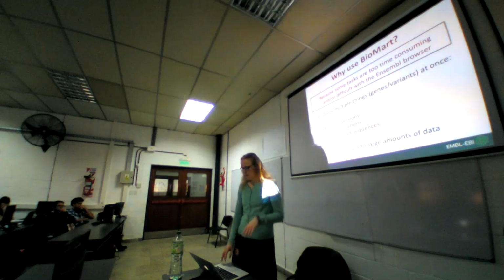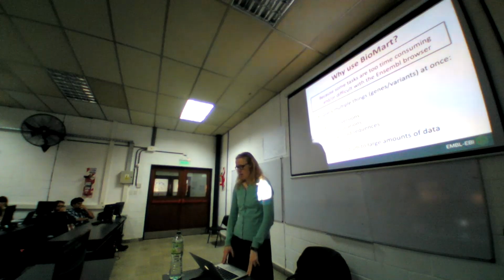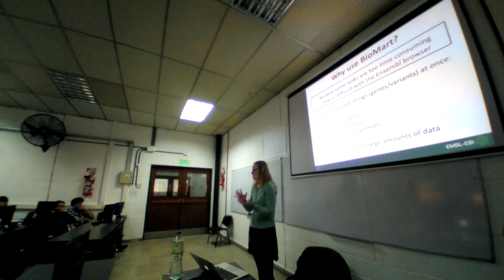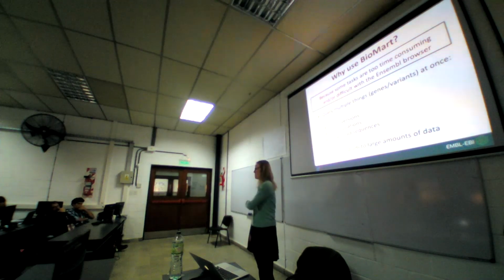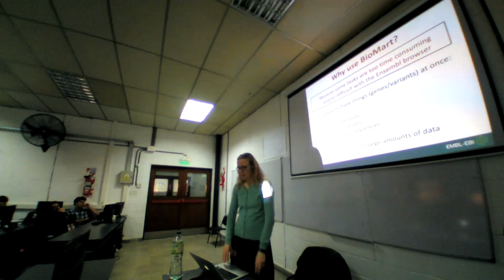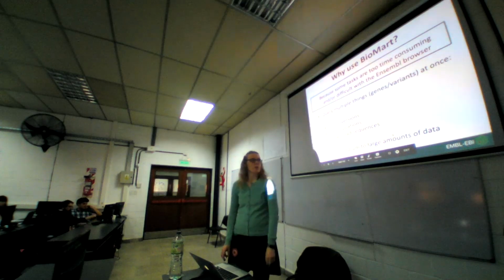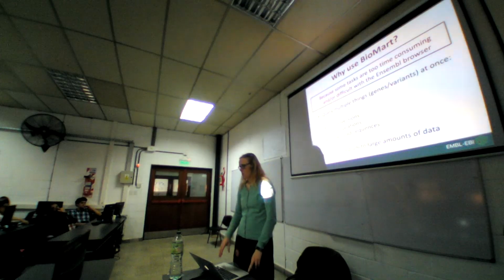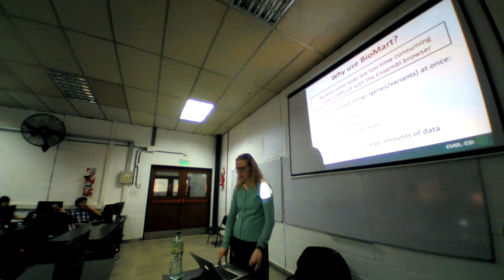Also, it can query multiple things in our database at once, which makes it quite useful for ID conversions. So you can convert an Ensembl ID into an HGNC symbol, into a RefSeq ID, and so on. And this is available for medium to large amounts of data, like hundreds or maybe 1,000 entries, but not huge amounts, for which we have other access methods.